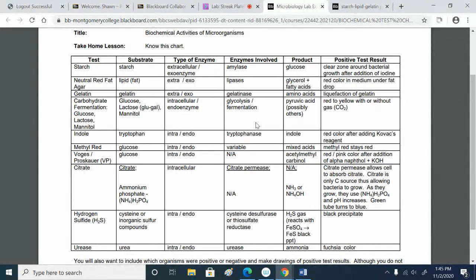And so lastly, we've just seen the hydrolysis of carbohydrate and fat. So what's left to use for energy is protein. Our source of protein is going to be gelatin. So of course, proteins are made of long chains of amino acids. And when you hydrolyze a protein, you just get amino acids. So intact proteins, the intact polypeptides, they can form a gel. Amino acids by themselves cannot form a gel.